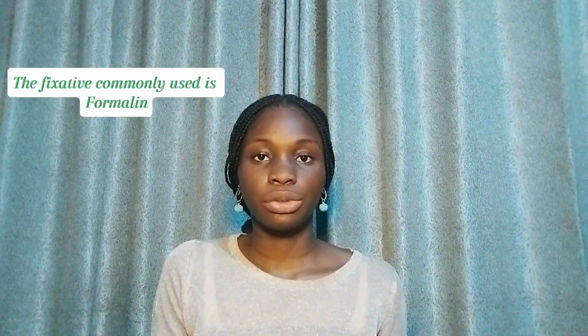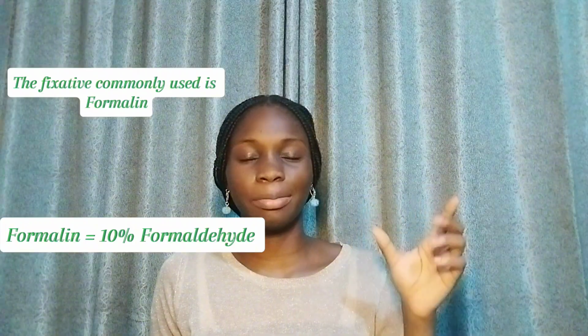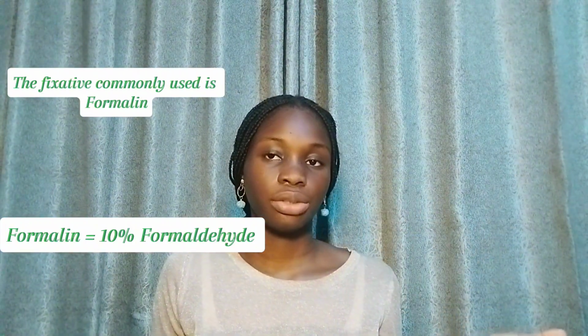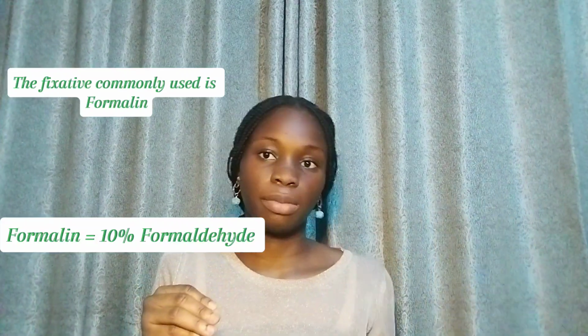But what fixative is commonly used? The fixative commonly used is formalin. And when you ask yourself what is formalin, formalin is a 10% formaldehyde. So when you want to fixate, you use formalin, which is a 10% formaldehyde.